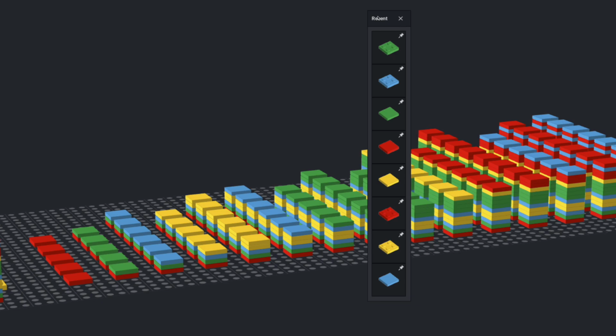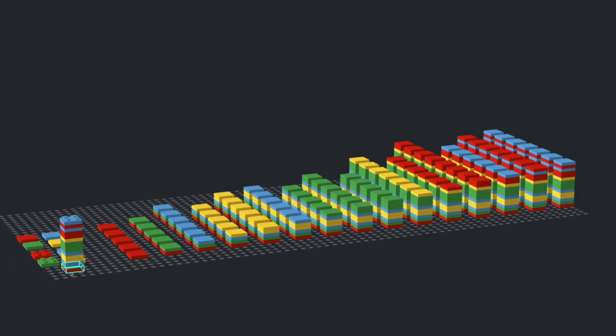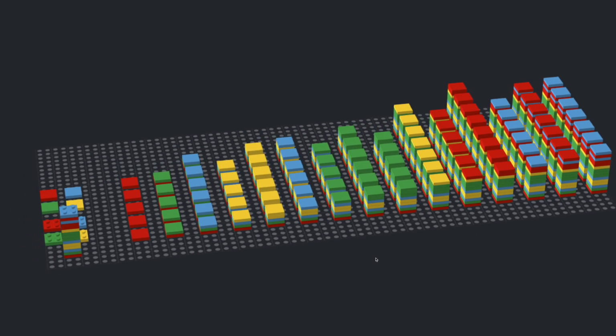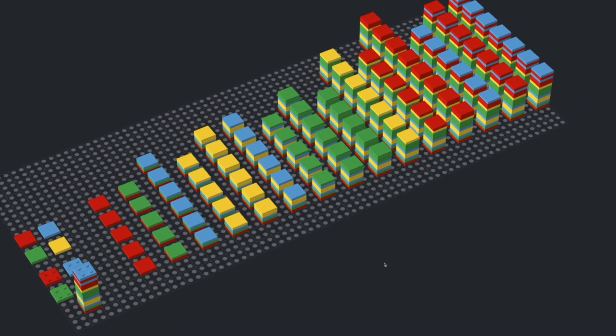And the end result, after millions and millions of tiny reactions, cycle after cycle of the PCR, is that we end up with all of these different length DNA molecules, all possessing that fluorescent tag at the final 3' position.